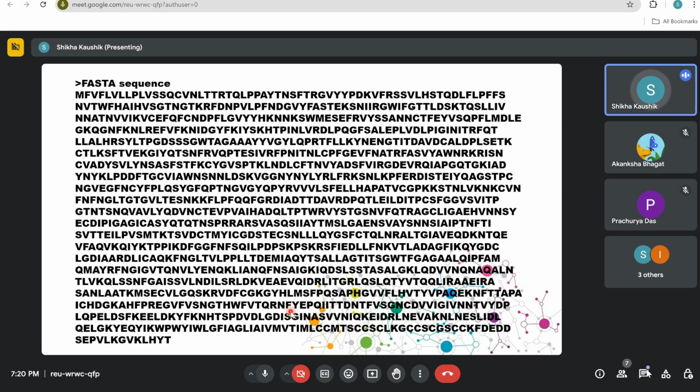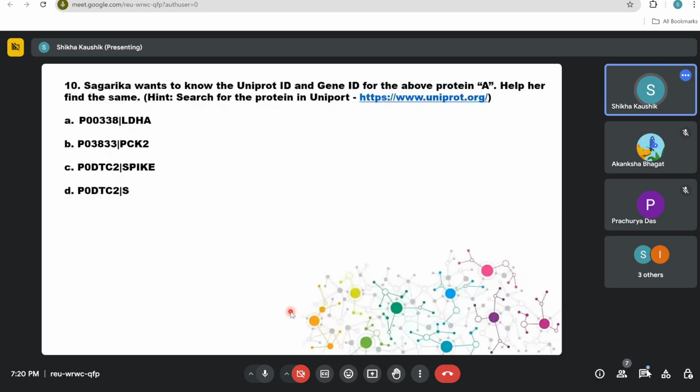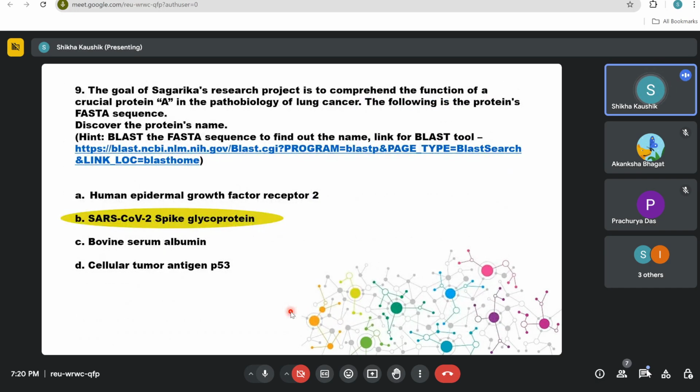So generally you have short peptide sequences, you align the sequences and you try to make a complete FASTA sequence. जितने भी पेप्टाइड फ्रेगमेंट है उन सबको अलाइन करते हैं. There are some common regions जिनसे अलाइन करके हम एक सीक्वेंस बनाते हैं. It may be a complete sequence, it may not be a complete sequence, but ये फास्टा सीक्वेंस को आप ब्लास्ट करते हो और ब्लास्ट करके आपको जो प्रोटीन मिलता है वो आप देखते हो, मतलब मैक्सिमम क्वेरी सीक्वेंस आपकी कवर हो रही होती है उस प्रोटीन.